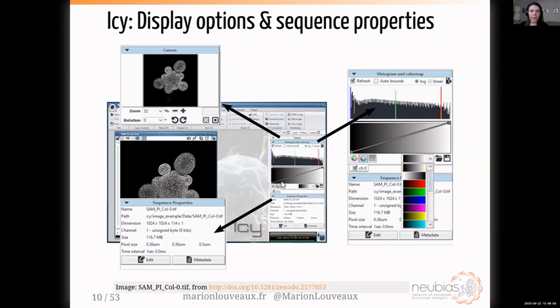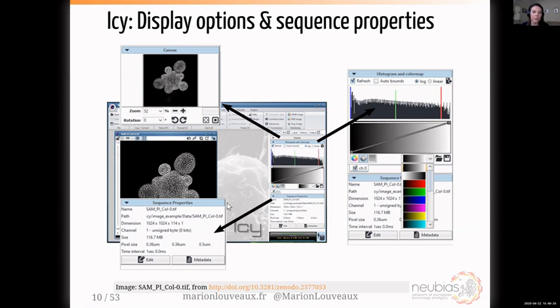In the side pane, you have options to display the image: the canvas for zoom and rotation, the histogram for adjusting contrast and brightness, and the sequence property that you can edit if the metadata were not correctly imported.